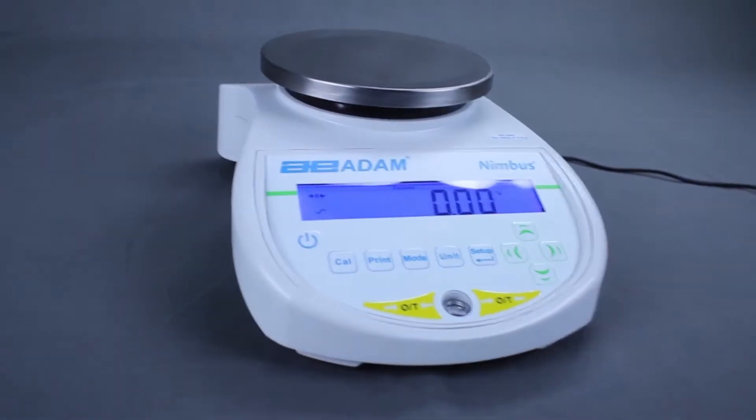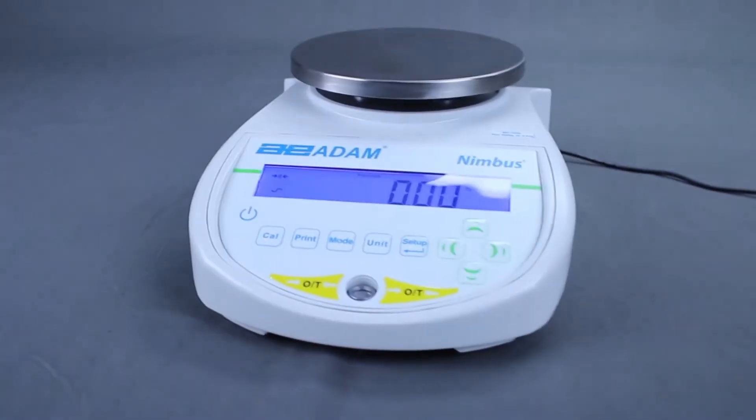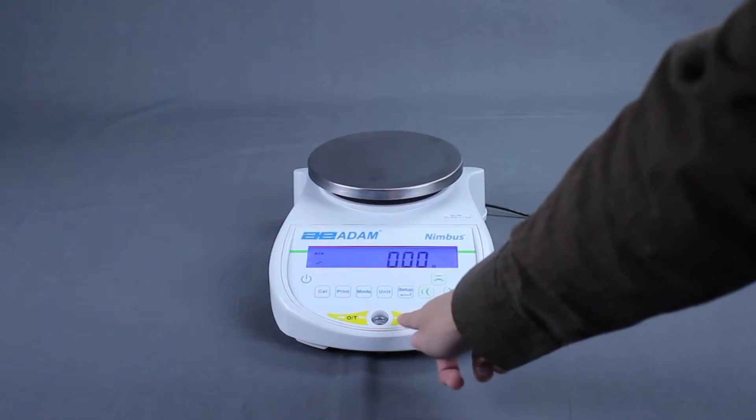The Nimbus lets you define a reference weight to be 100%. All subsequent samples will be displayed as a percentage of that reference. Clear the weighing pan and make sure the display is at zero.